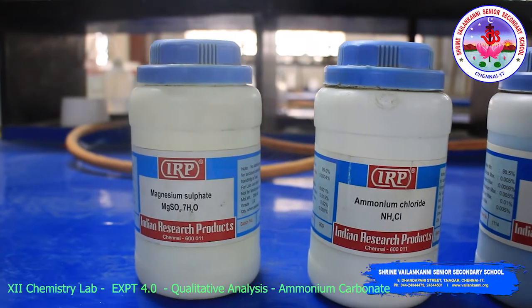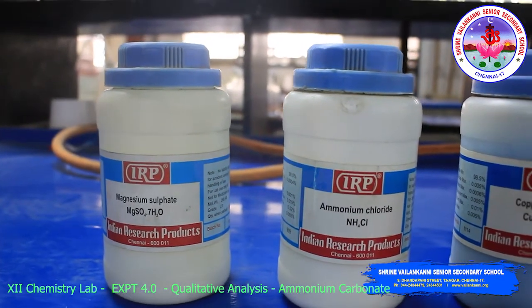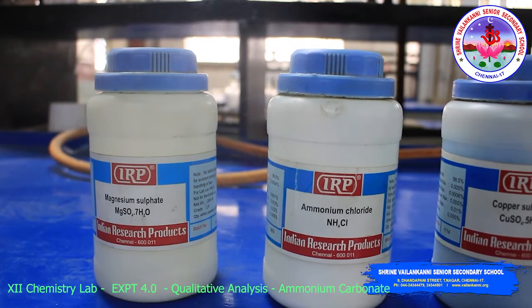Students, we will perform these salts. Usually in the examination we don't tell you what salt is given, you have to identify it with the help of the systematic procedure.